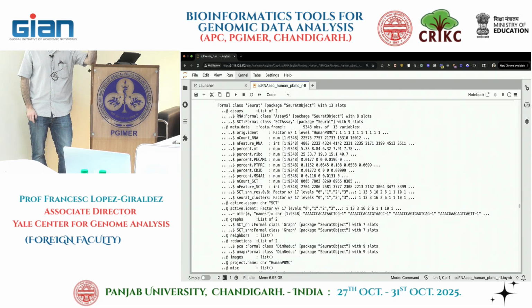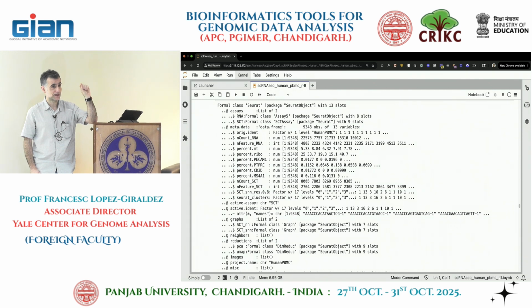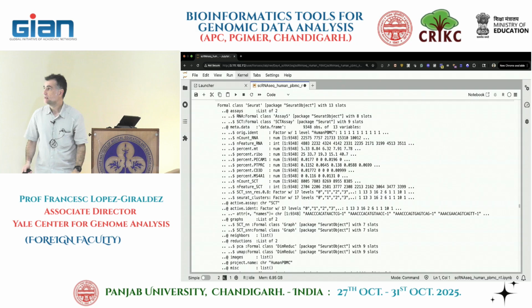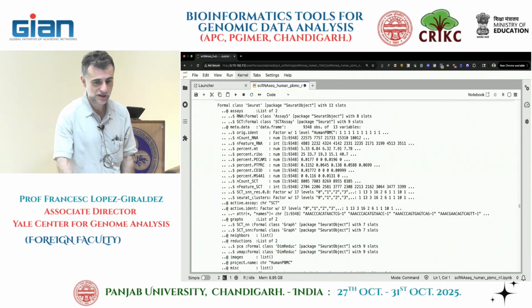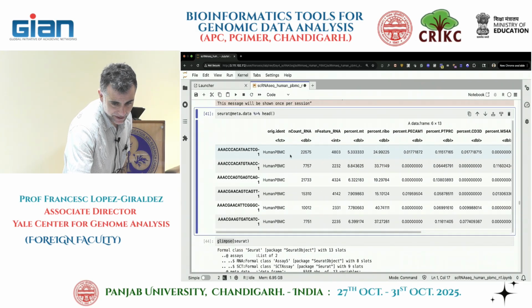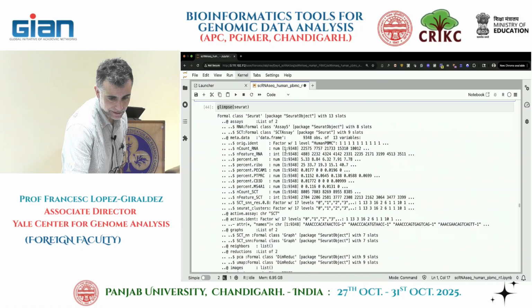We notice that we ran the clustering process and the UMAP. Now we have a new column in our data because we ran the clustering, which indicates the identity of every cell by cluster. It assigns a cluster to every cell. That's the clustering process, right? But there's another thing that changed in our Seurat object, which is the identity of the cell. The first column in our metadata was the original identity. If we go back, every cell was labeled as the original identity, human PBMC. Now we have a new column called seurat_clusters.